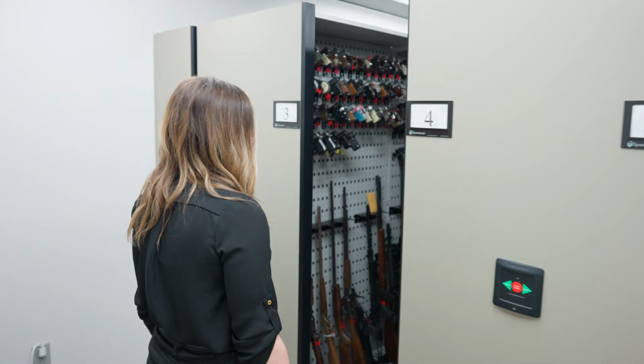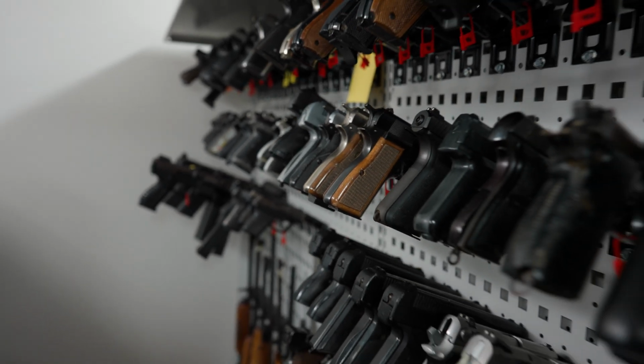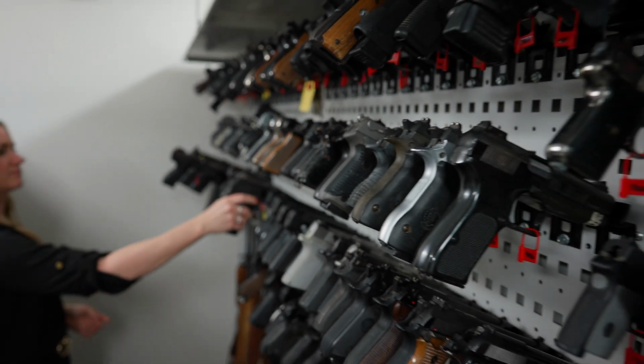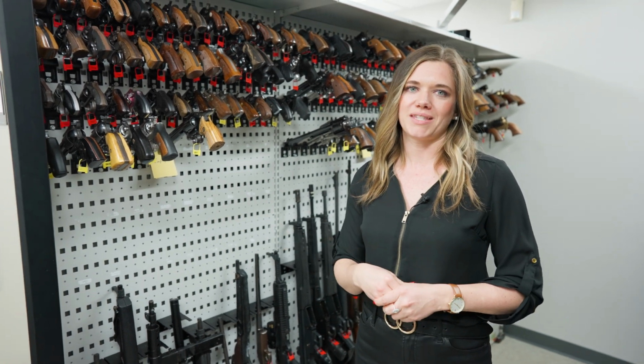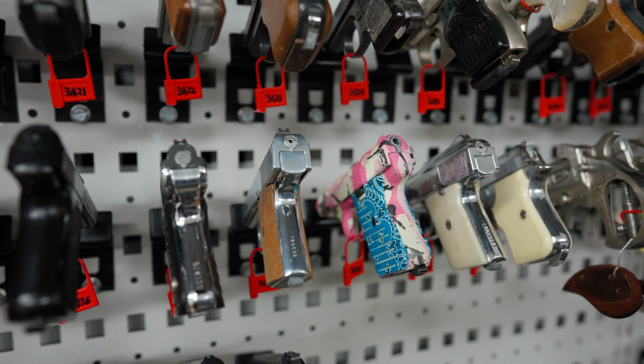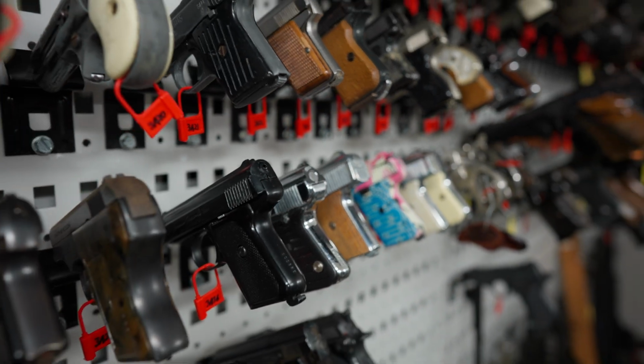This is our firearm reference collection. Our reference collection is made up of hundreds of different crime firearms. These crime firearms are used for training purposes, not only for new examiners, but also for recruits and crime scene classes as well. We also use these firearms in the event that a gun comes in and it does not function, and we need a part to make that firearm function. We can pull that part from this gun. We can also use these firearms as a reference for serial number restorations, for the serial number format, as well as just for having some fun.